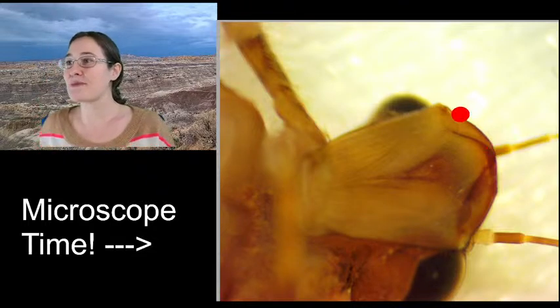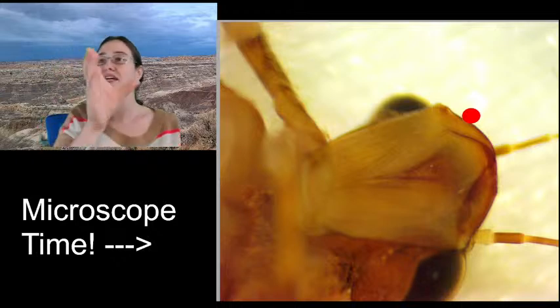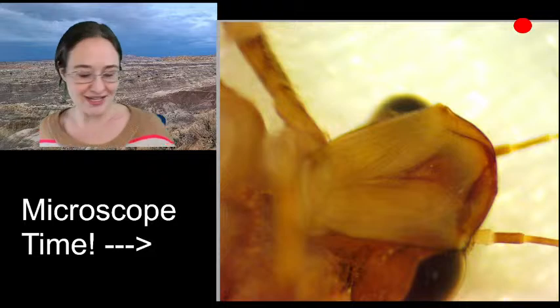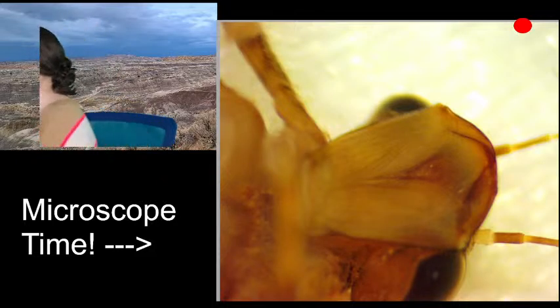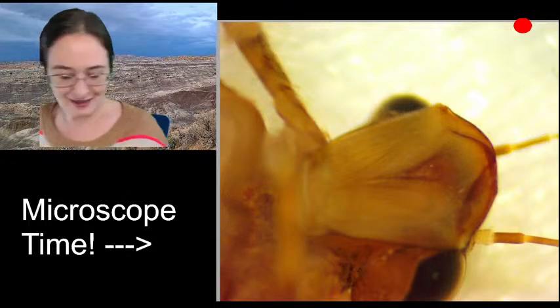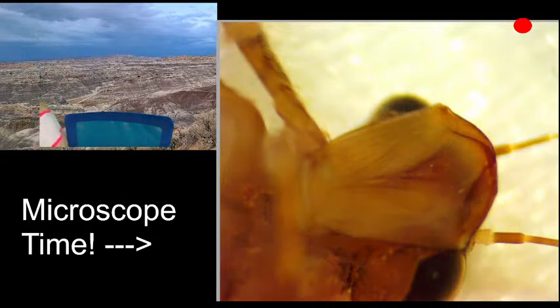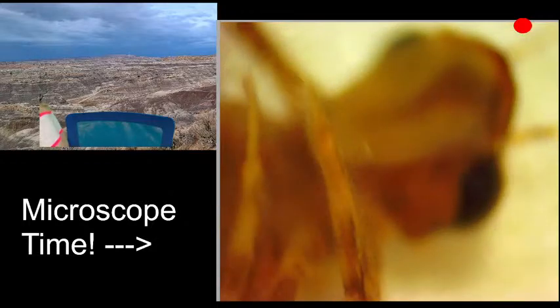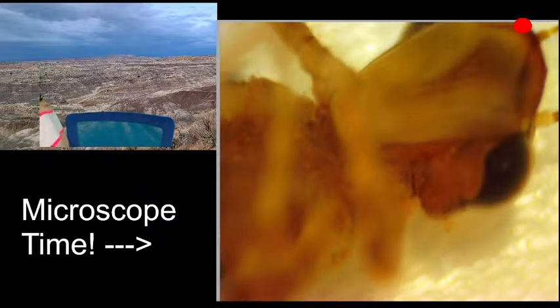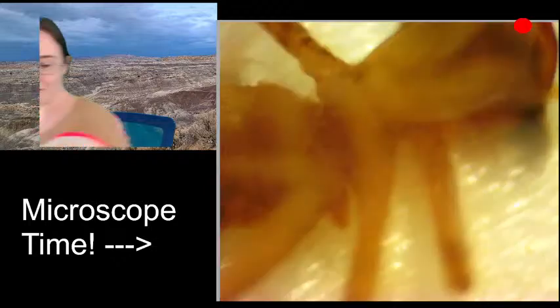Chewing mouth parts, it's mandibles, right? So this is where it's going to open and close and grab with. So let's see how well I can do this and also hold the specimen straight. It's going to be fun. Yeah. All right, we're going to need another pair of forceps.